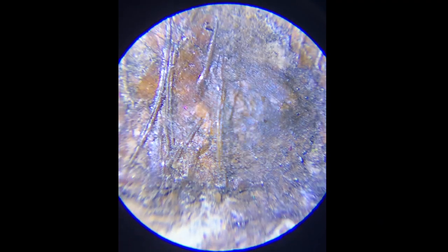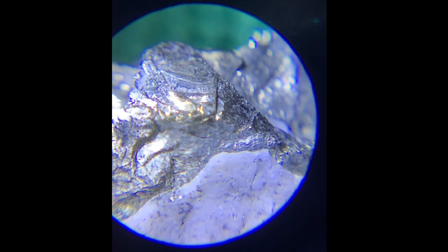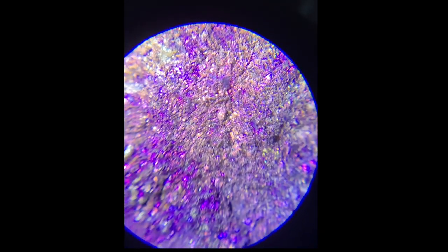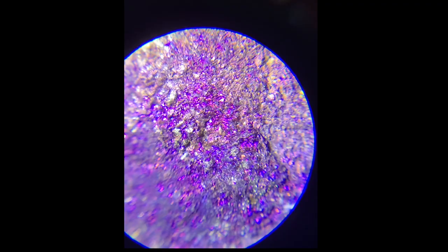Oh my goodness, this is so cool — very, very lovely. It looks like I'm walking on a mountain range here. Let's take a look at the Peacock Org. Oh man, am I looking at vibranium?